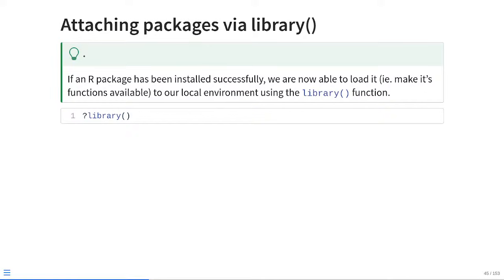So if we have already installed dplyr, we need to then make the next step, which is making sure it's actually attached to our local environment. Everything in R, once you've installed it, when you're trying to get it to actually be present and all the tools available for you to use, this happens via the library function.